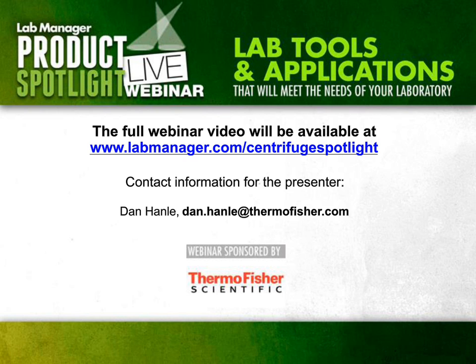But again, all that hardware you see and all the ease of use won't mean a lot if that's not getting done. But if that's the case, if people have it in good repair and close it as it's designed to be, there are people all over the place using these things safely and properly, feeling secure in their use of the centrifuge. Absolutely.